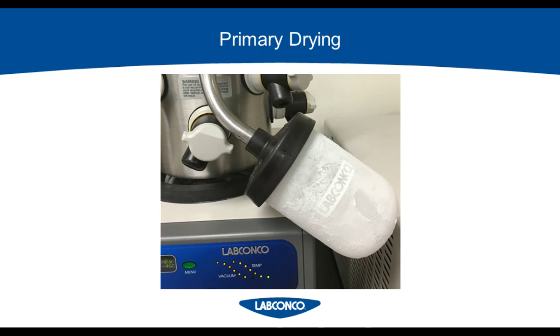Once your sample is frozen and you start your freeze dryer, you'll begin primary drying. As you can see in the picture, there is so much evaporative cooling happening during this step that you will get frost buildup on the outside of your flask. This is a good indication that your freeze drying process is going well. If you see the frost start to melt as well as your sample, this is indicating that there is a problem with your run. At this point, you are no longer freeze drying and your sample is undergoing evaporation.